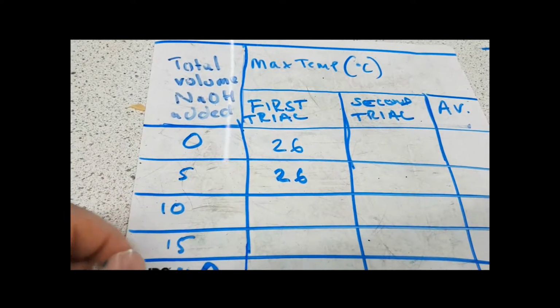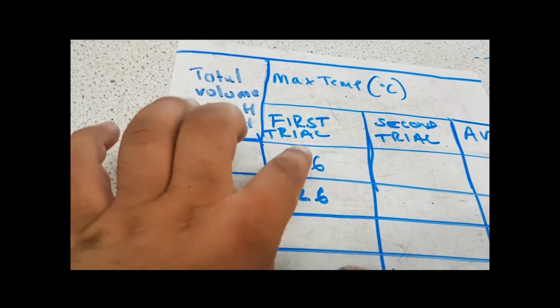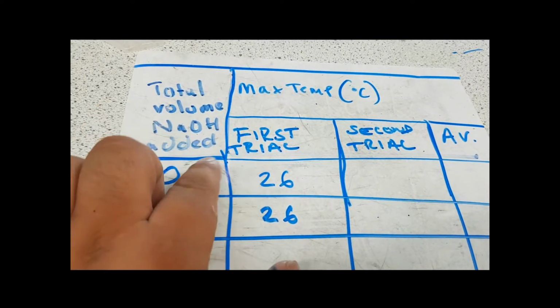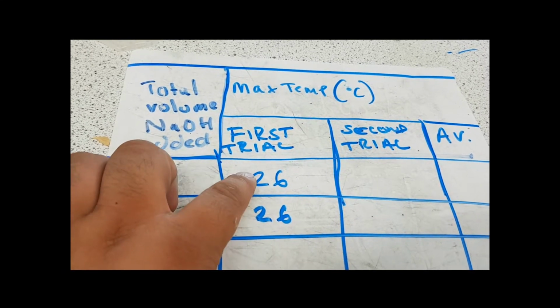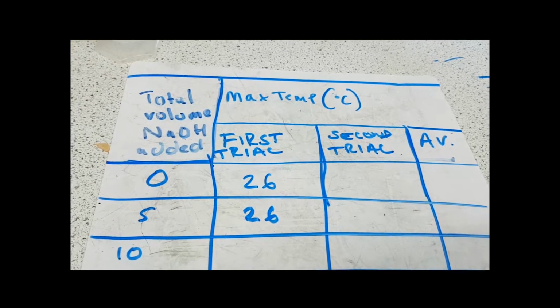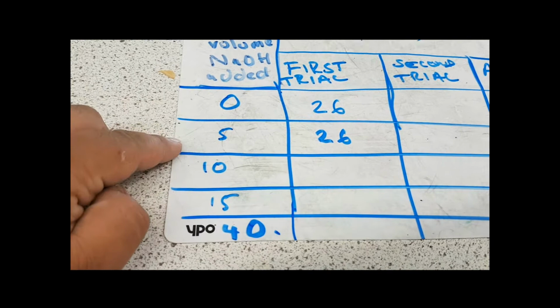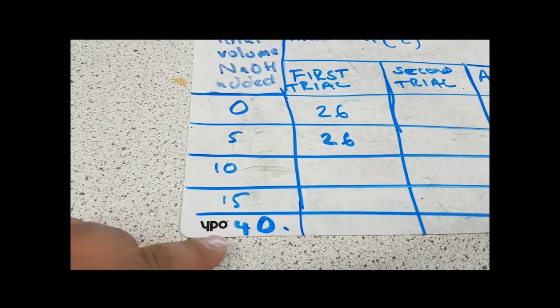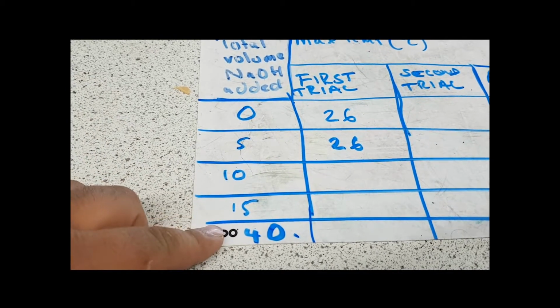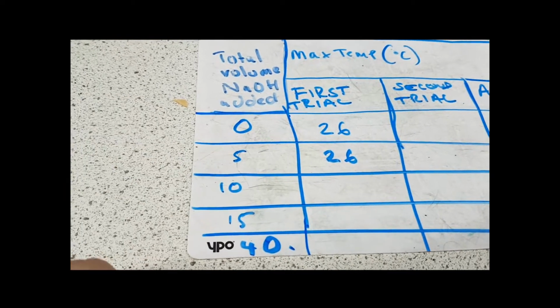You're going to repeat this experiment twice. At this moment in time, I've added no sodium hydroxide, and I did this experiment earlier, and the temperature that I got when I added no sodium hydroxide after I stirred it was 26 degrees Celsius. Then we're going to add 5 milliliters at a time of sodium hydroxide up until 40. Obviously I've run out of space, you guys have a workbook, so you won't. So 0 to 40, and we're going up 5 mils each time.